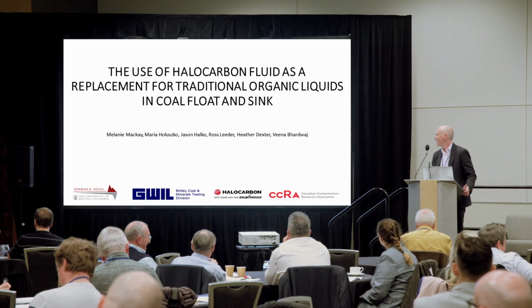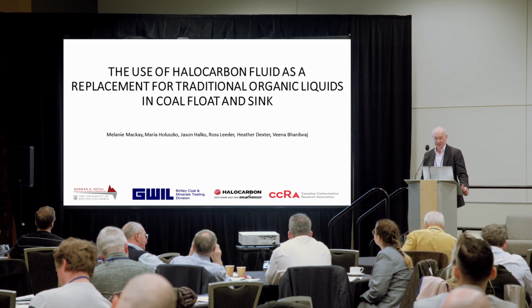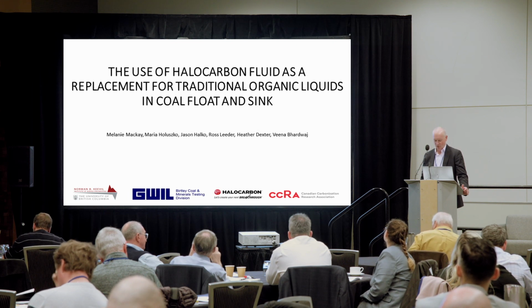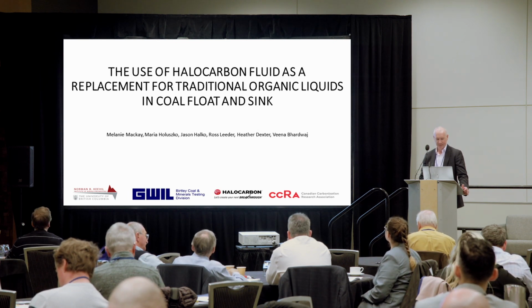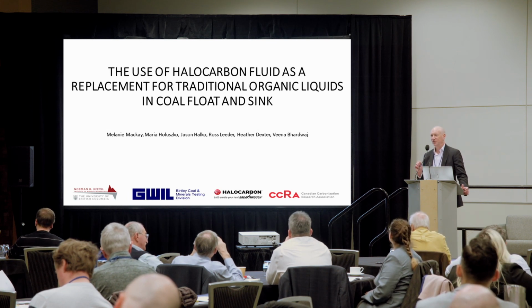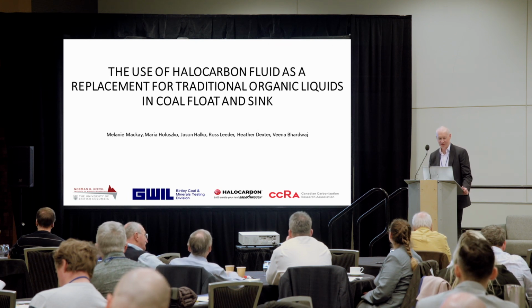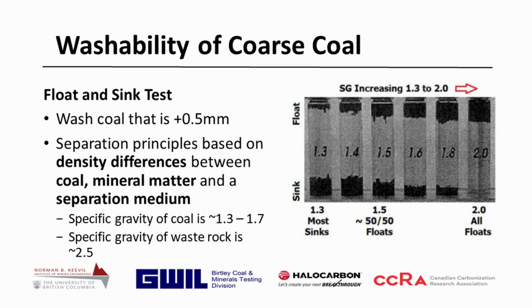So anyhow, we're going to kick it off taking a look at halocarbon as a substitution, replacement for some organic liquids. So before we get into the details, just going to give a high-level coal processing 101 overview. Really, when we take a look at coal samples, and these samples could come from exploration, coal seams as you're actively mining, stockpiles to confirm your quality, there's a really simplistic way in the lab to give you an idea as to what your coal qualities are.